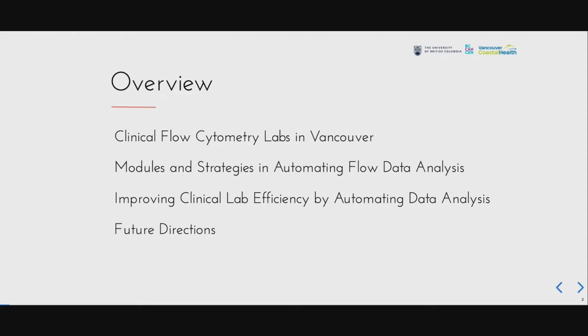So here's an overview of today's presentation. I'll begin with a brief introduction to the clinical flow cytometry lab in Vancouver, BC, Canada. That's where I came from. I will then move into the core topics: flow cytometry data analysis, automation strategy, and the essential tools and modules involved to build automated data analysis pipelines.